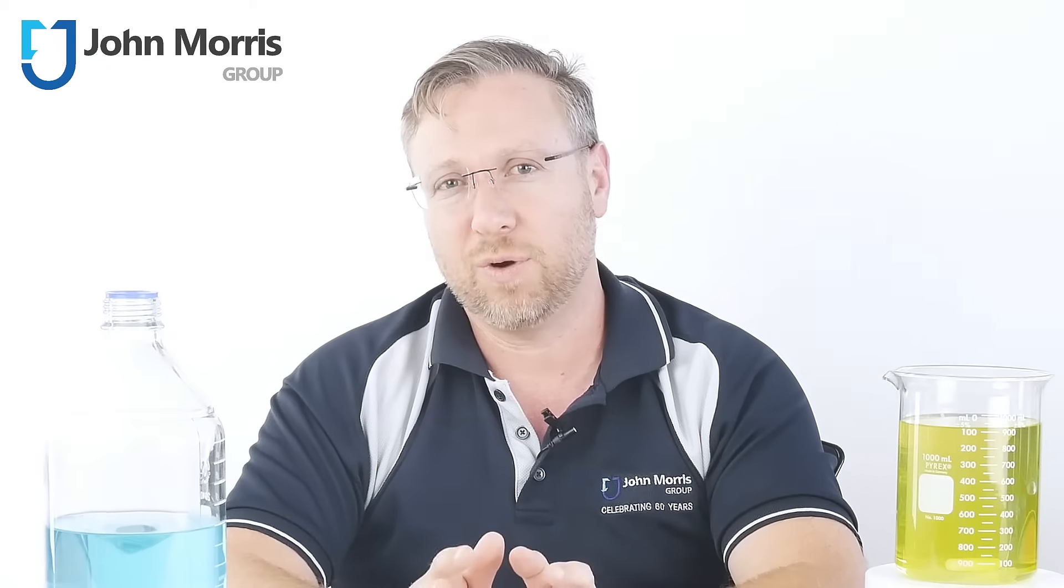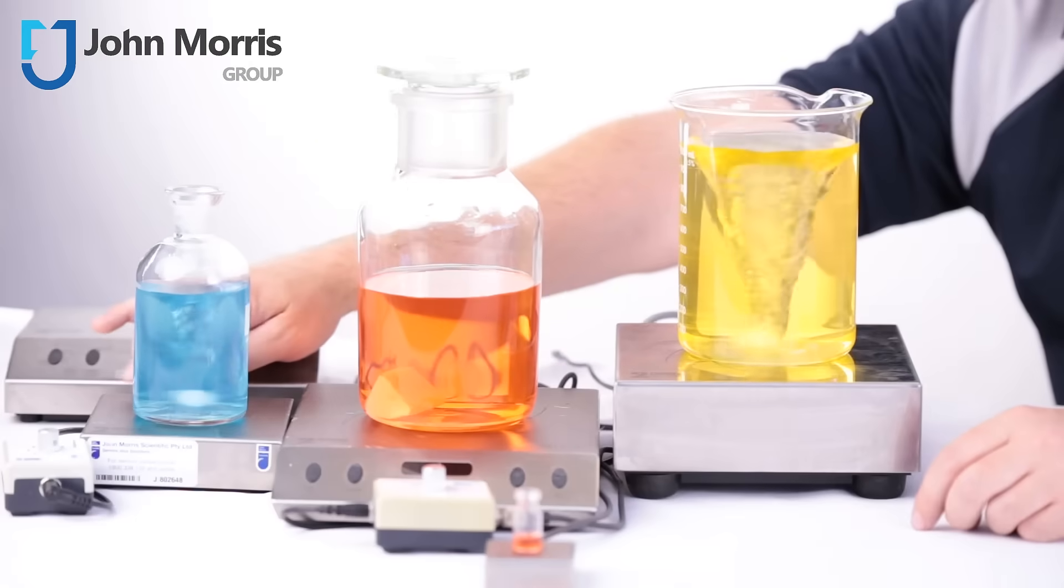However, today we'll be discussing the 2MAG brand of stirrer, which is still designed and manufactured in Germany.